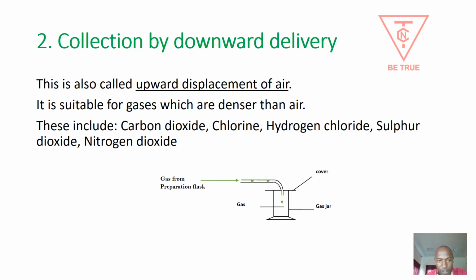It is suitable for gases like carbon dioxide, chlorine, hydrogen chloride, sulfur dioxide, nitrogen dioxide, and others. It's those gases that are heavier than air. They are capable of flowing downwards, pushing the air upwards in the container.